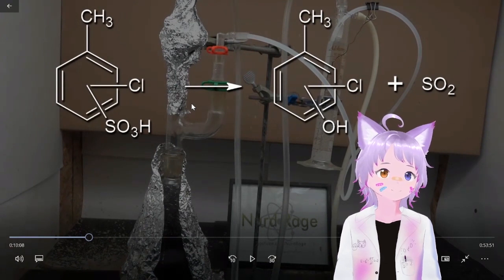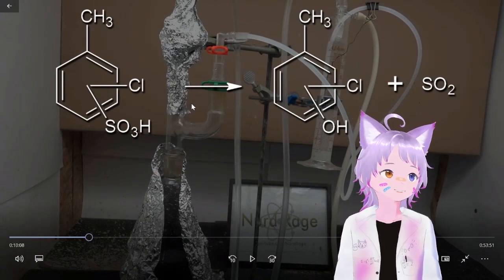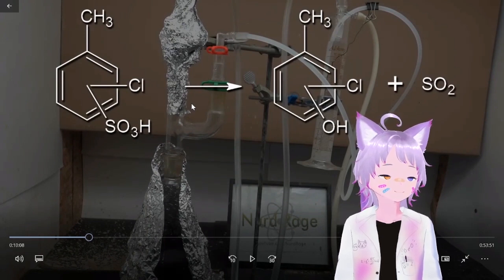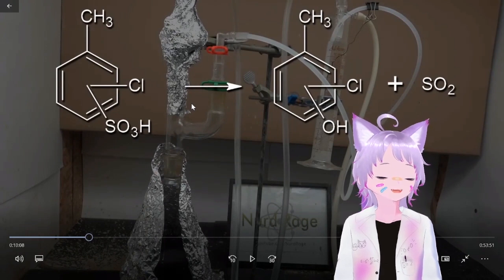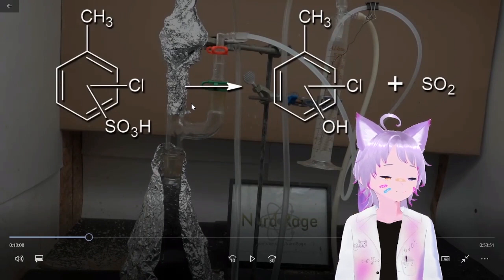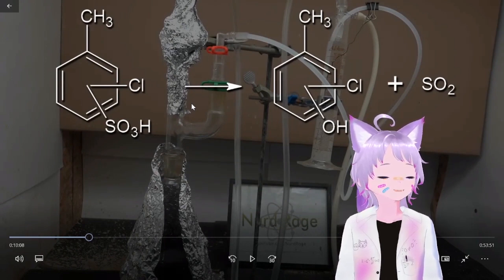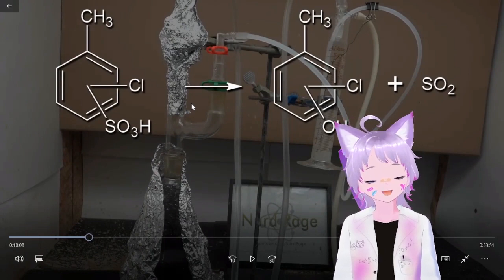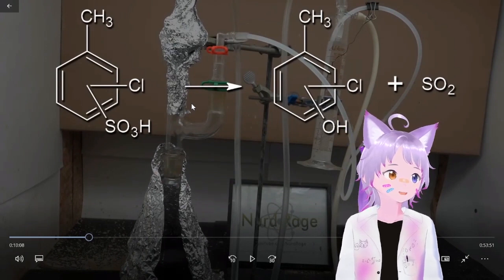1/3. Yeah, but remember we have an addition funnel, so we just have to have a drip rate. So we can do everything at once instead of doing this multiple times, if you think about it. In fact, I think it's actually good to do a slight molar excess if our goal really is parachlorotoluene. But if you really want both, then you do a molar equivalent and check it and check again.